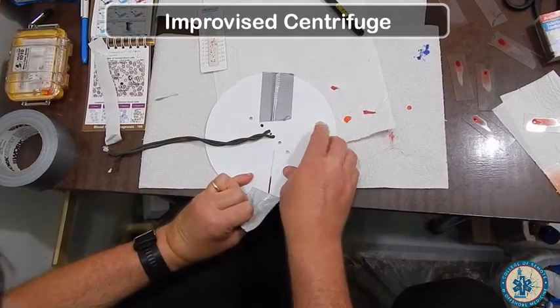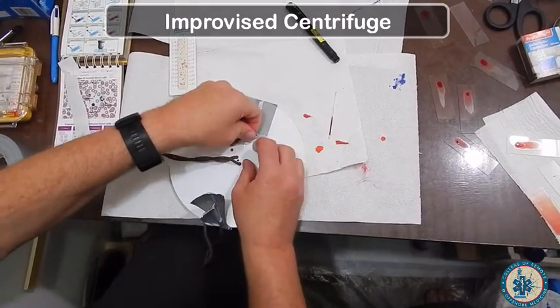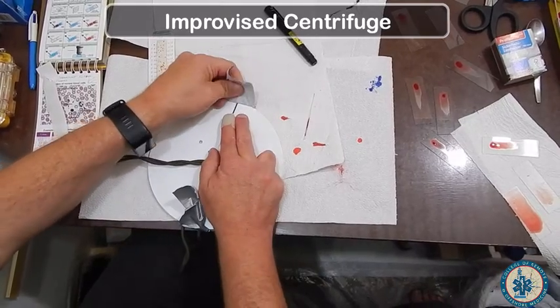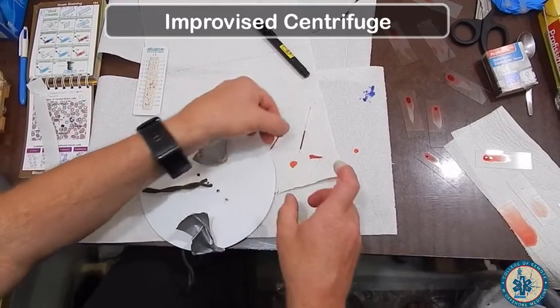Once your five or six minutes are up, you will carefully take off the tape from your paperfuge, making sure you don't break your capillary tube. These do break pretty easily, so make sure your capillary tube stays on the paperfuge as you're removing the tape.